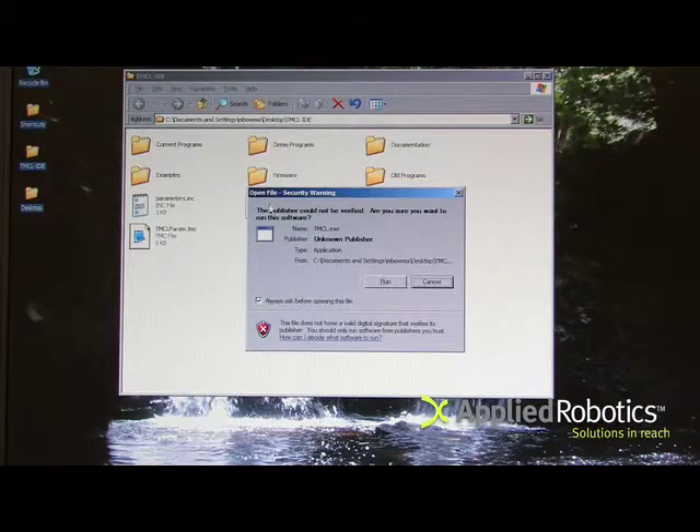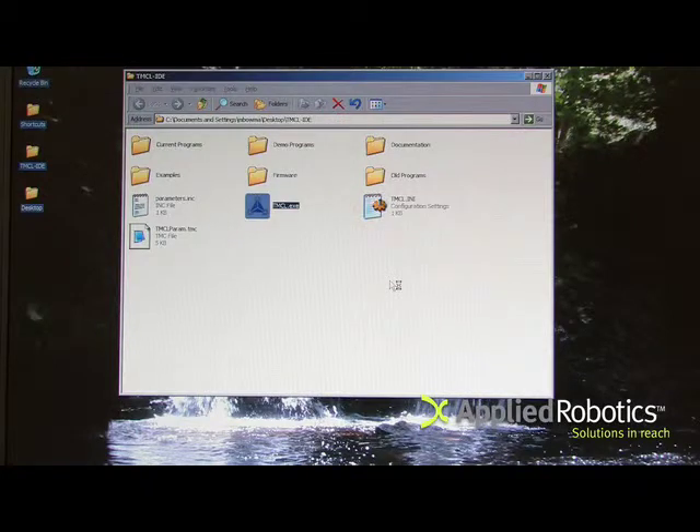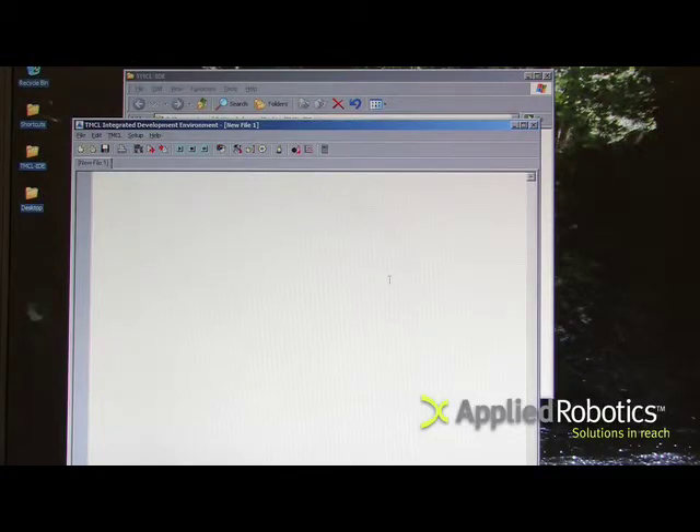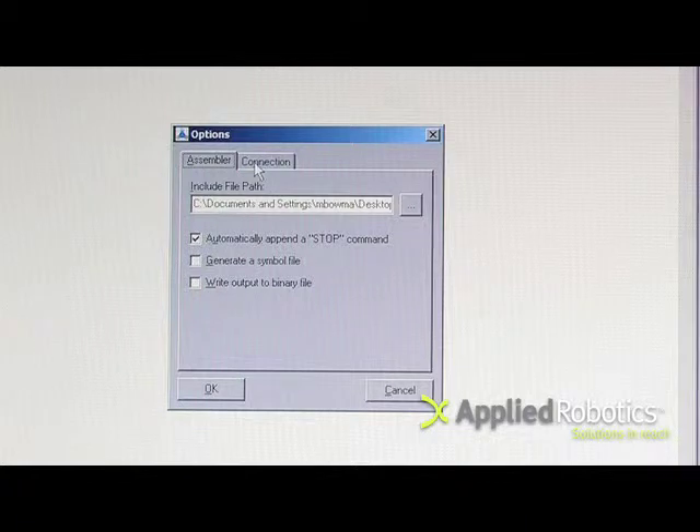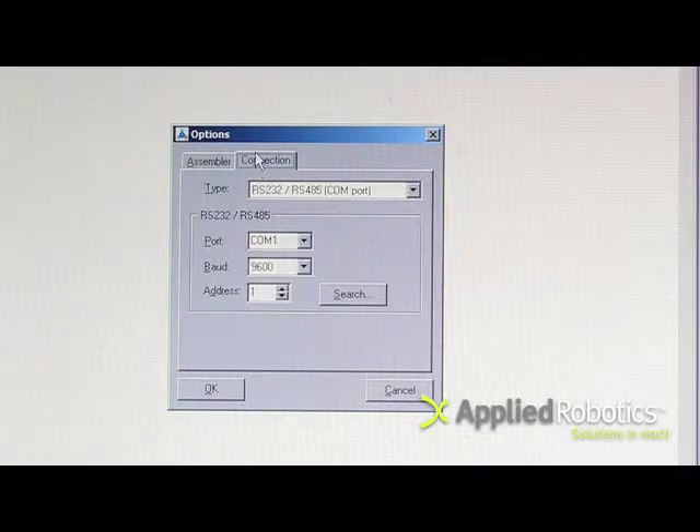Download the TMCL program from the Applied Robotics website and run it. Make sure the connection is configured properly by using setup options or the options icon. Select the connection tab and then confirm the port is set to COM1. The baud rate is 9600 and the address is 1.